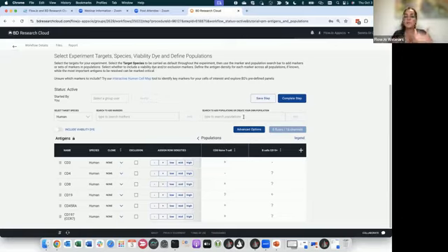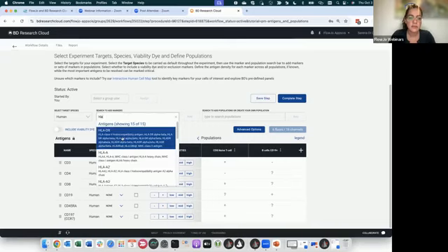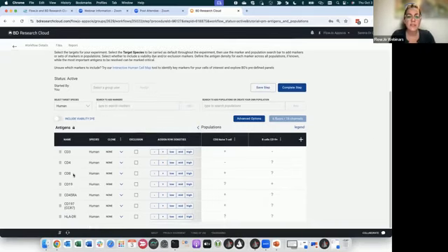And while you are adding more populations, these can also be your custom populations, or you can add markers individually. Let's say HLA-DR, for example, add. While you add more markers here, you will find the species, and then you can define if it's an exclusion marker or not, and you can also assign row densities and say, okay, this is really highly expressed, this is mid or low expressed. And if you have defined populations, it will tell you already this is positive or this is negative, this we don't know yet, and so on.